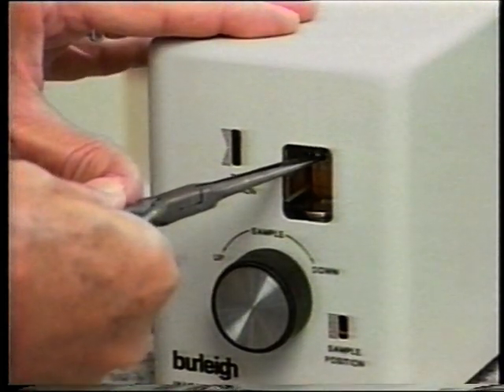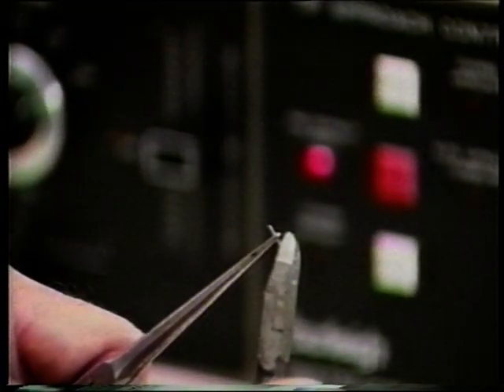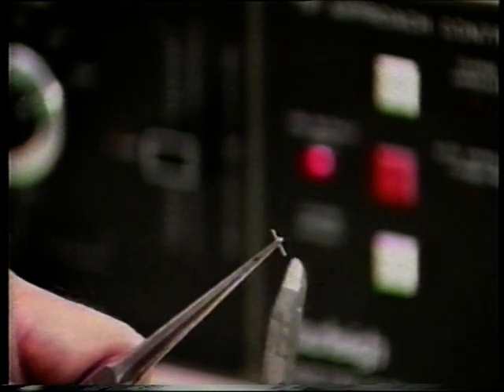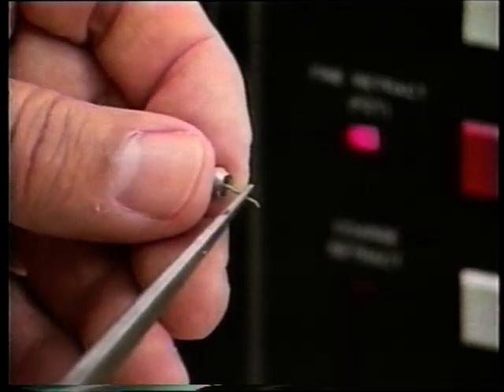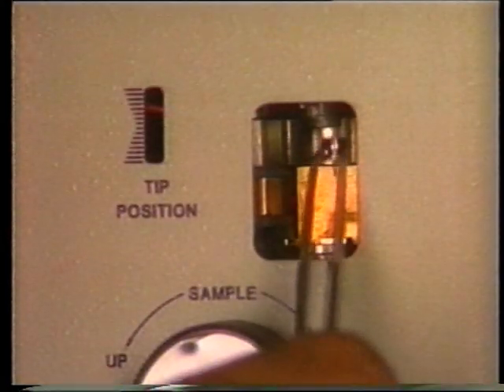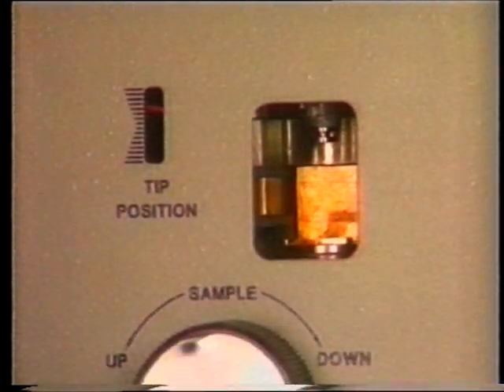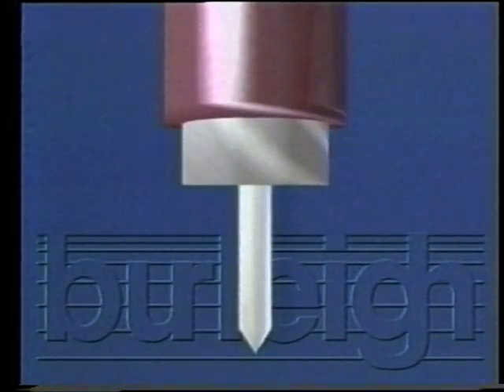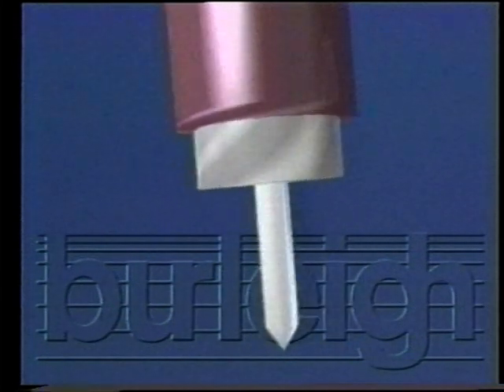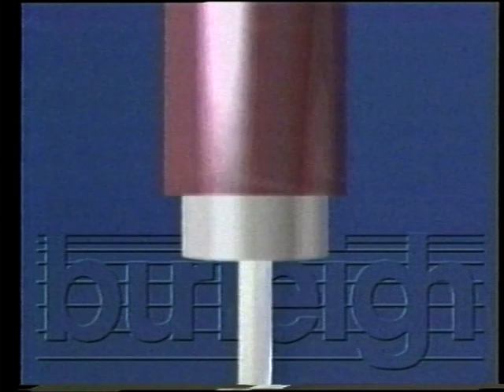To replace a probe tip, remove the tip carriage from the scanning head and follow the tip wire preparation procedure in your manual. Once the tip wire has been prepared, insert it into the carriage and replace the carriage into the head, making sure not to damage the tip or your sample. The probe tip carriage is attached to a tubular piezoelectric or PZT element for X, Y, and Z raster positioning.